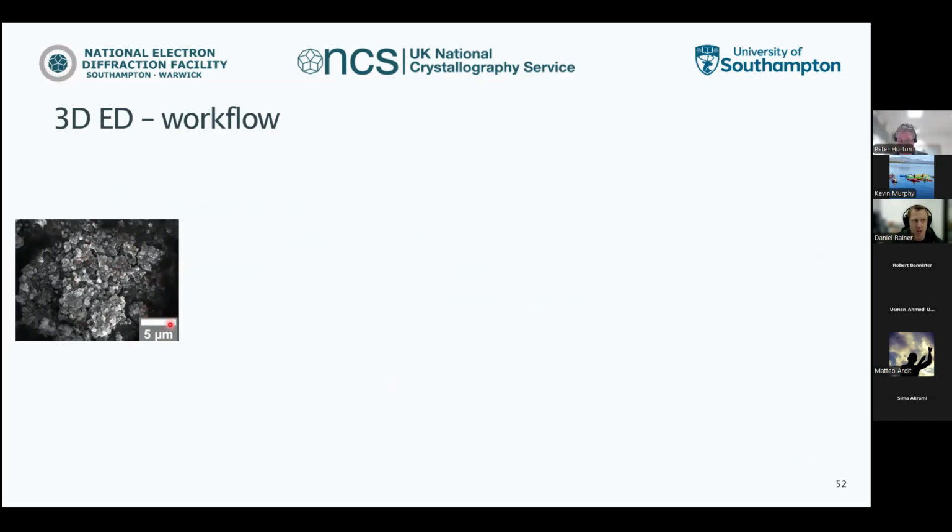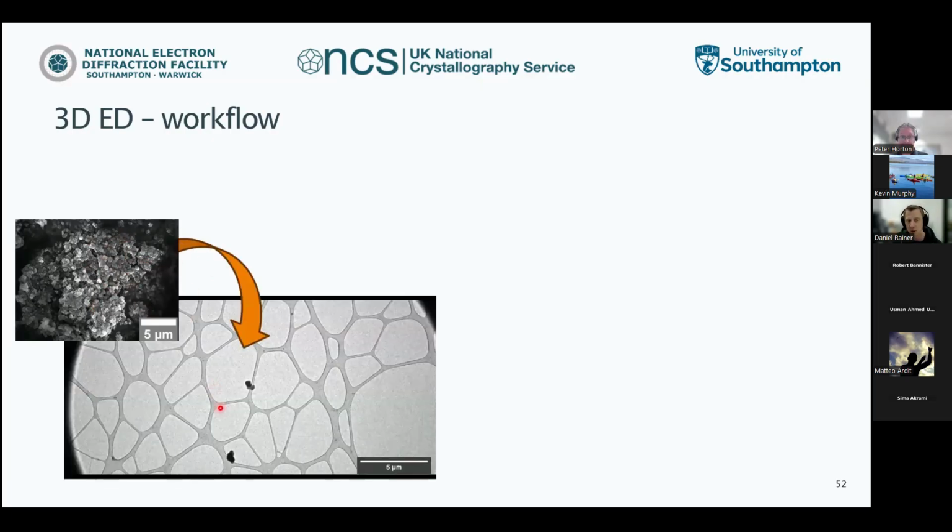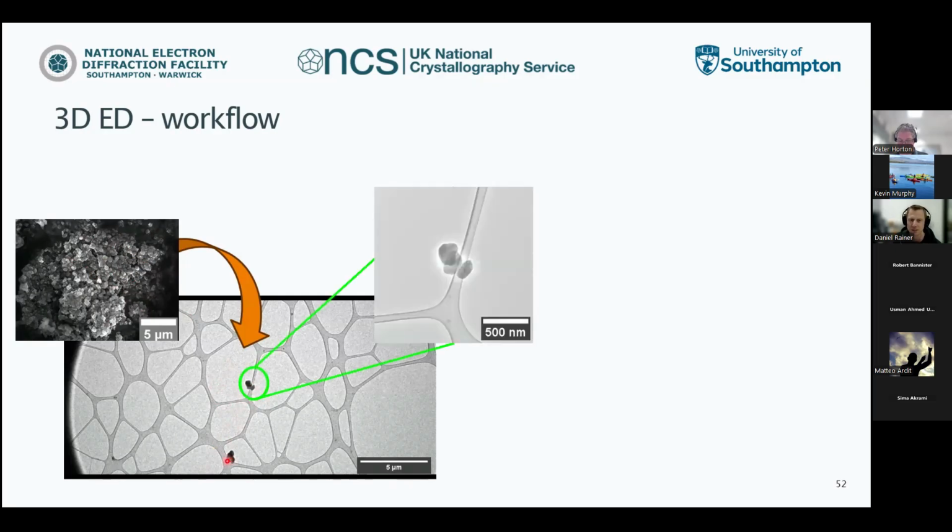It's an SEM image, and so they are currently quite agglomerated, the particles, right? So I created a suspension, hopefully broke these up. And actually, this is then what it looked like on the grid on the instrument. And if you're quite keen-eyed, you can already see it's actually not one crystal, but it's actually three, well, hopefully crystals that lie on top of each other.